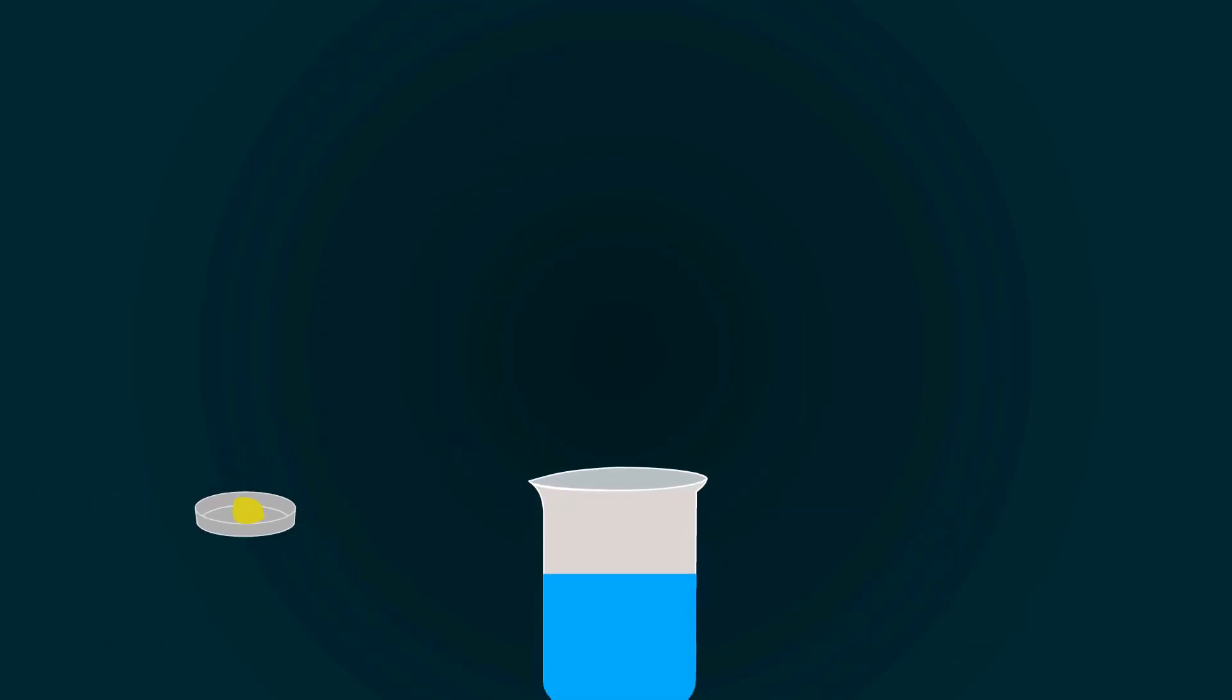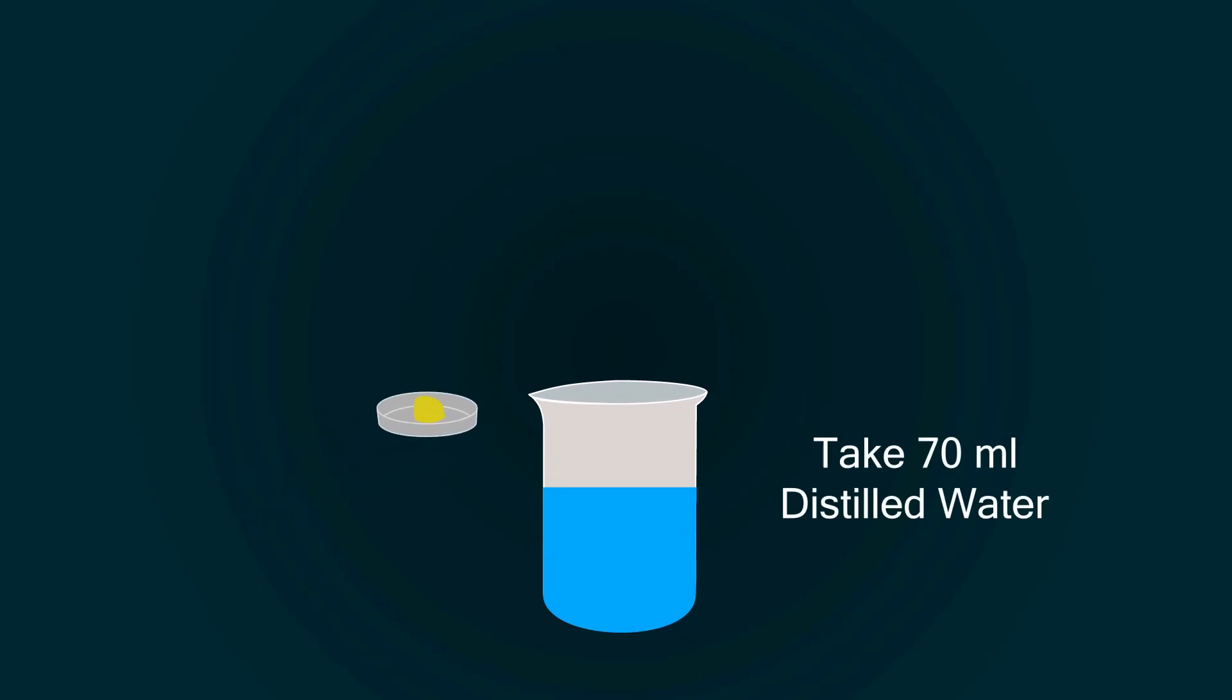Now take some distilled water in a beaker up to 70 milliliters and put the potassium chromate into it. Start mixing it with the help of a spatula to make a homogeneous mixture.